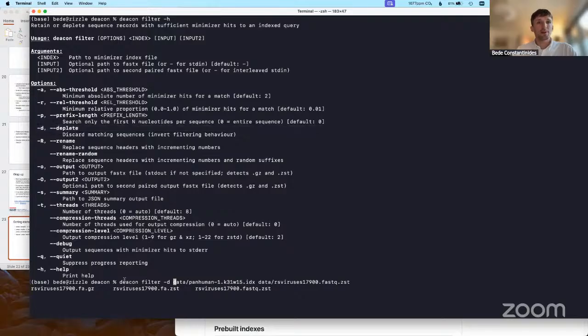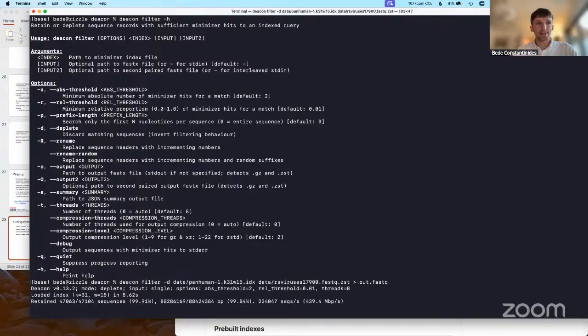So I'm going to go deacon filter -d, then our index path, then our FASTQ path, and then out.fastq. I've pressed enter and it's running, by default with 8 threads. It takes a few seconds to load the index, especially the first time, and now it's running.